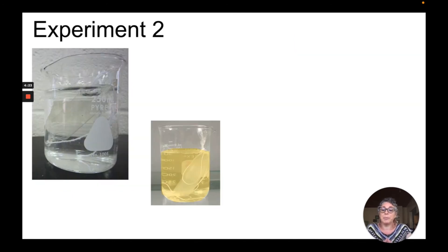In experiment two, we have a setup where we are using the viscing tubing and in this case we're going to put a starch solution into the viscing tubing and tie it off at both ends. This is then placed into a beaker of pure water.